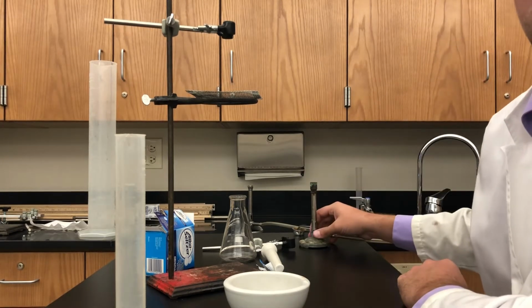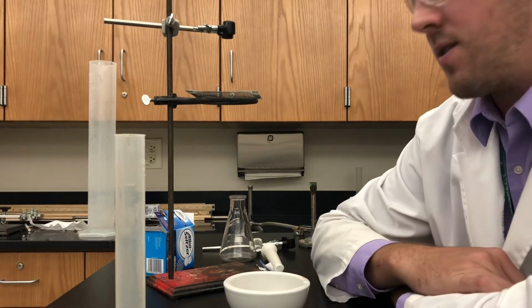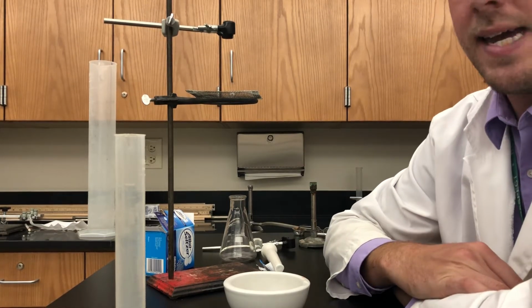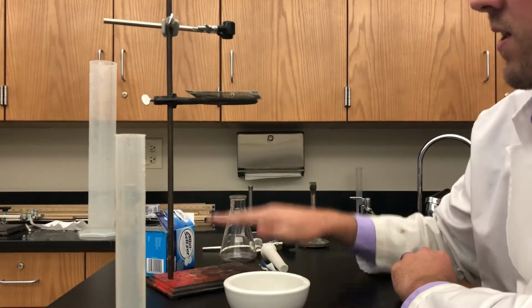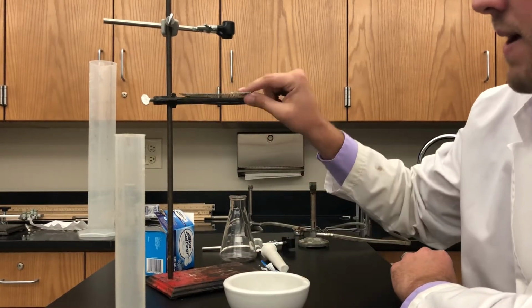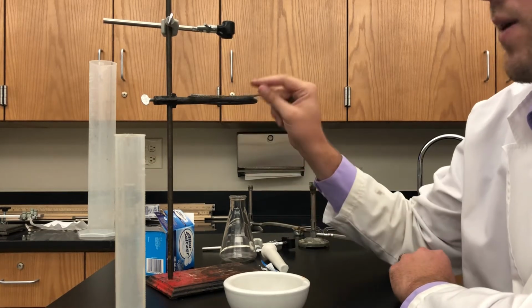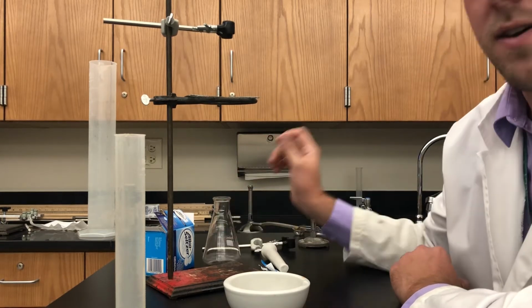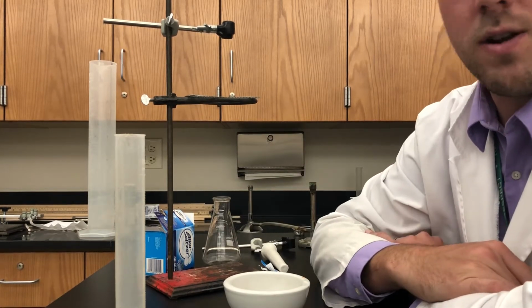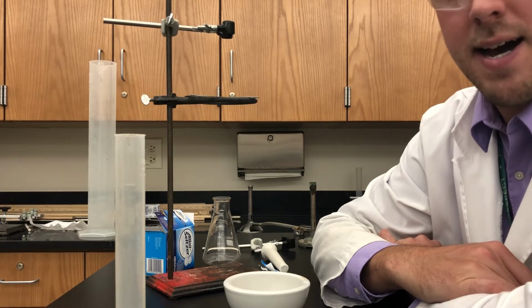Obviously, just don't do anything dangerous with a flame. But the other main safety concerns have to do with what the flame is making hot. So you will have it underneath here. This is a ring stand and a wire mesh. The ring is going to get really hot. The wire mesh is going to get really hot. The Erlenmeyer flask is going to get really hot. So one of the sayings I have is cold glass looks just like hot glass. Cold metal looks just like hot metal.